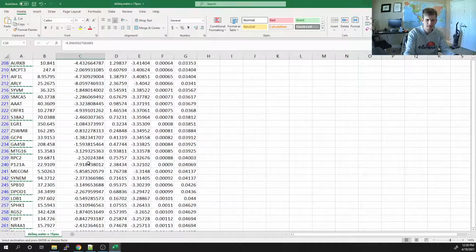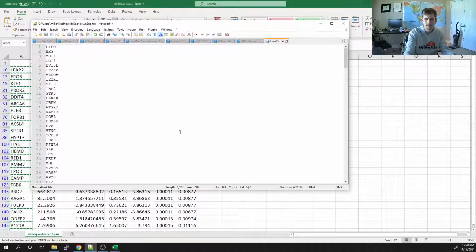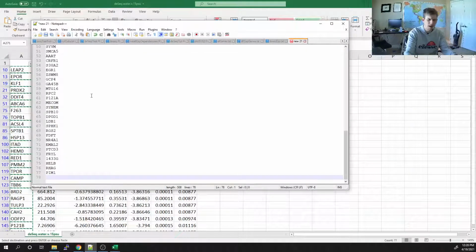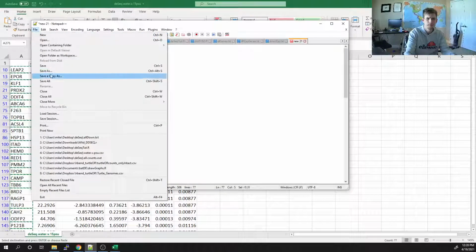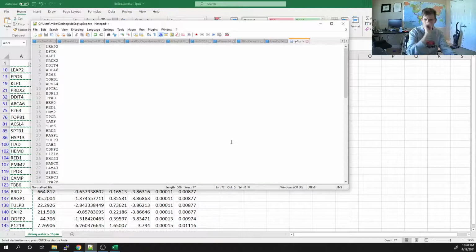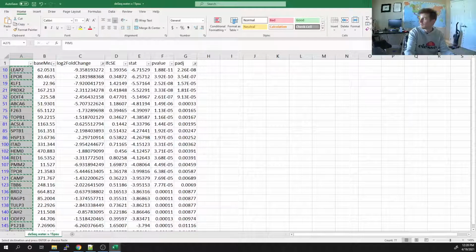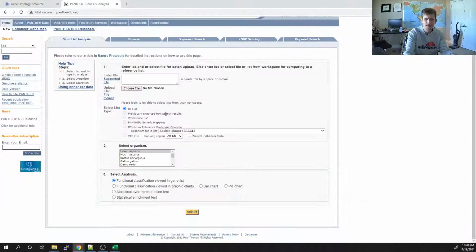Okay, so I'll copy this list and call it up. So now we have down and up. All right, remember, most of the time, if we're seeing a differentially expressed gene, most of them are less expressed in saltwater turtles than freshwater. But again, let's just play around with this.